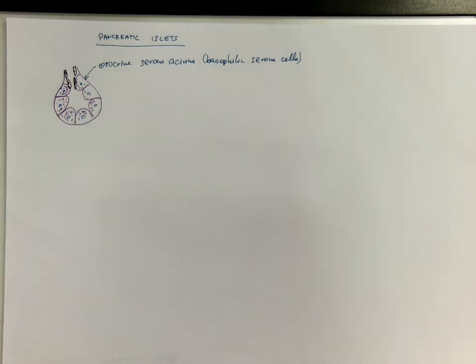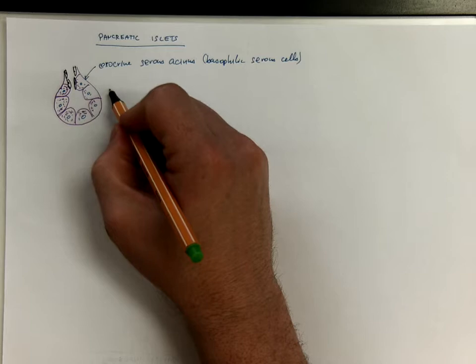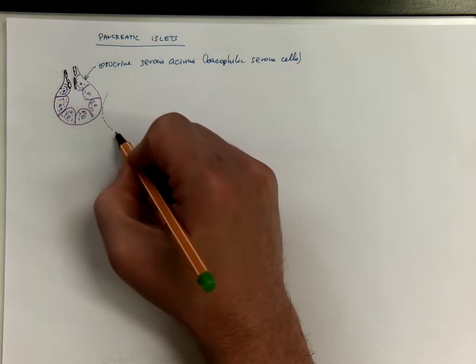In contrast to these you can find the endocrine islets of various size.